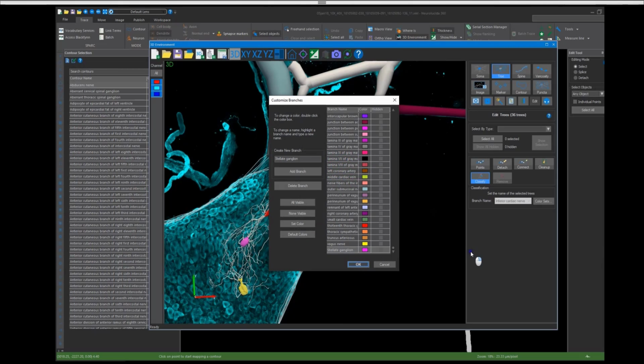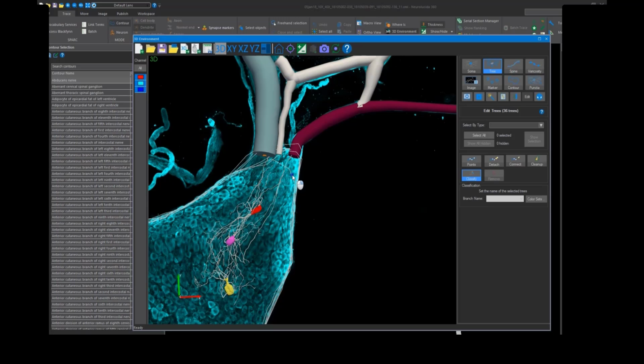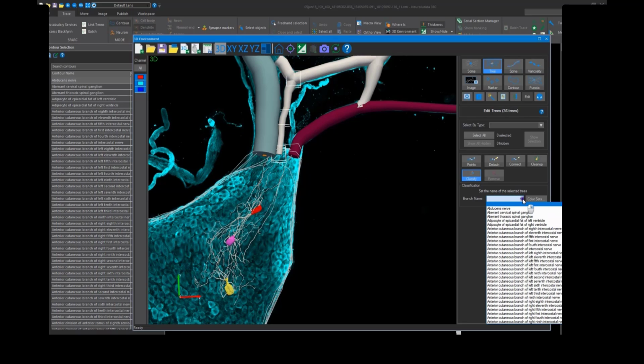And when you do that, that term will be added just to this list at the moment, and you can name that structure with that term. You will not receive a persistent unique identifier at that point because that term isn't yet in SciCrunch. But what Aiden is going to show you is how to update files even more after those terms have been added to the ontologies.